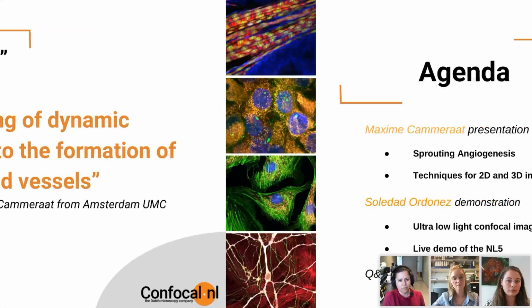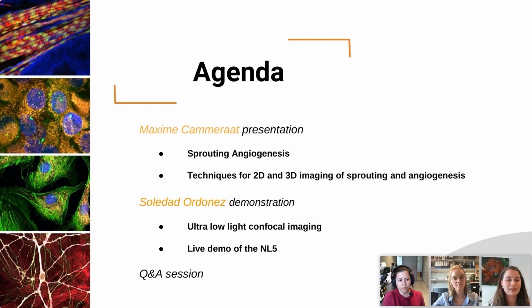About the agenda of today's webinar. We will start with a presentation from Maxime Cammeraat, who will talk about sprouting angiogenesis with a focus on the techniques for 2D and 3D imaging of these processes.